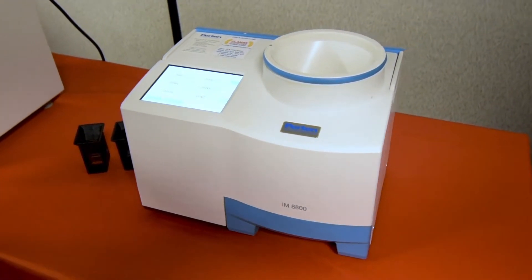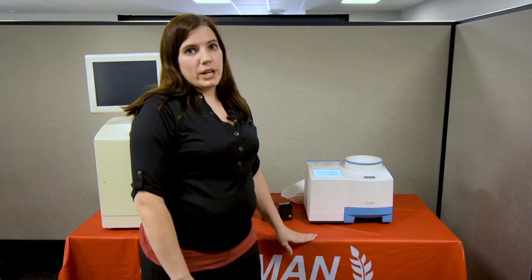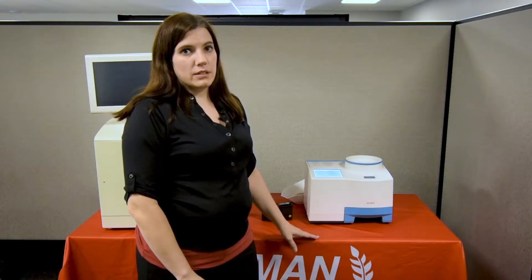The second unit we have is the IM8800. This is the on-farm portable unit. They both use near-infrared to determine the protein in the grain.